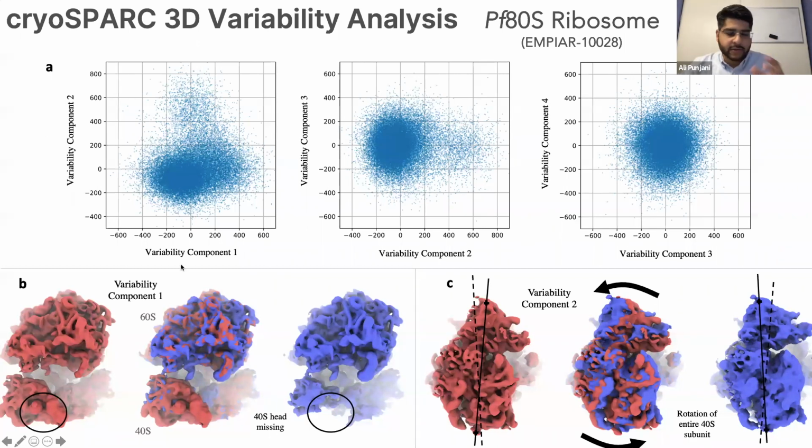And in fact, you wouldn't just measure the range, you would literally measure the variance. That's the importance of a component. And so we don't know that ahead of time. We don't know what the components are, but the nice property of this algorithm is that it will solve the components in the order of their variance. So it will pick up the high variance components first.